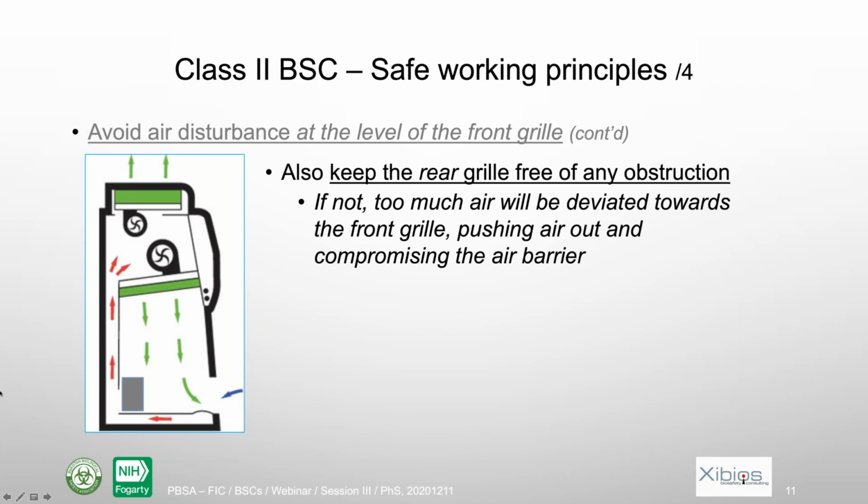If you block the rear grill, that means that the air which should be sucked at that level will go to the front. That means that there will be more positive pressure here, and that means that you will lose your protective barrier. So if you block the rear grill, there will be more air going out at the level of the front grill, and you will expose yourself. This is something that we often overlook, but definitely we should never block the rear grill either.